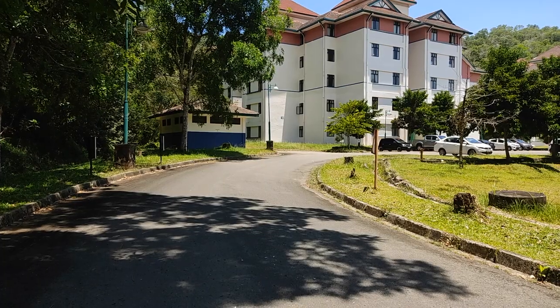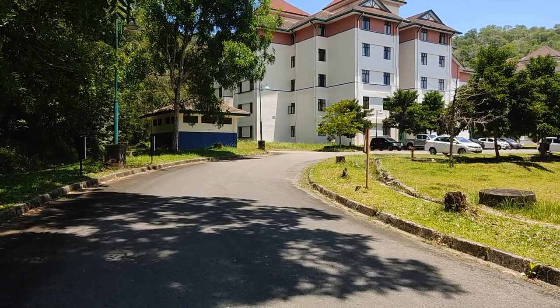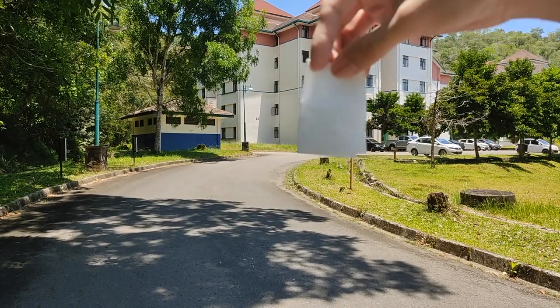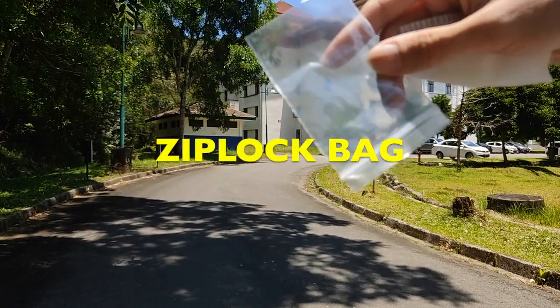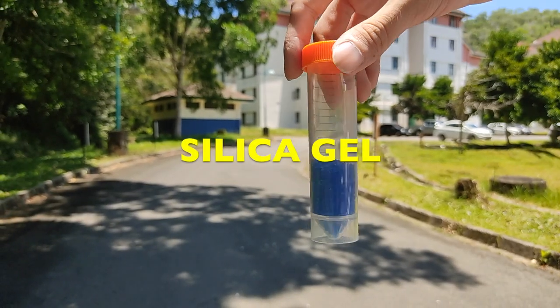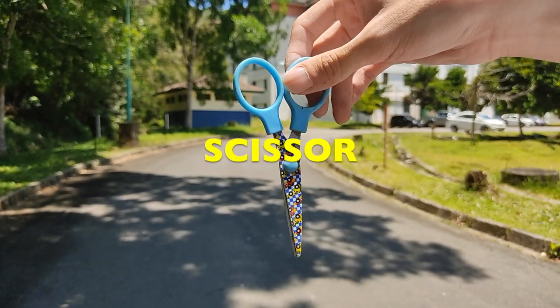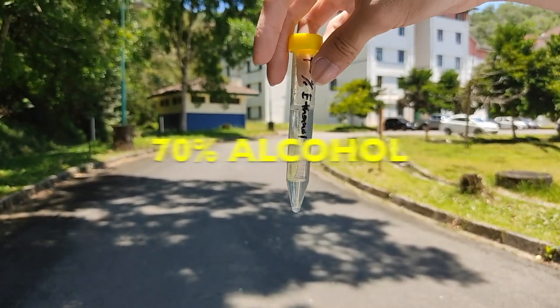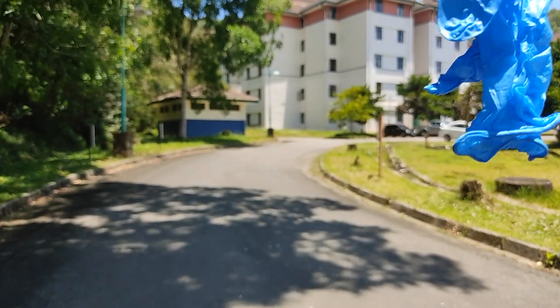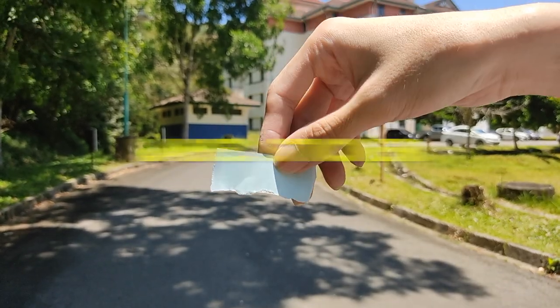Before we start, these are the list of materials that you need for plant sampling: empty teabag, ziplock bag, silica gel, scissors, 70% alcohol, rubber gloves, and label sticker.